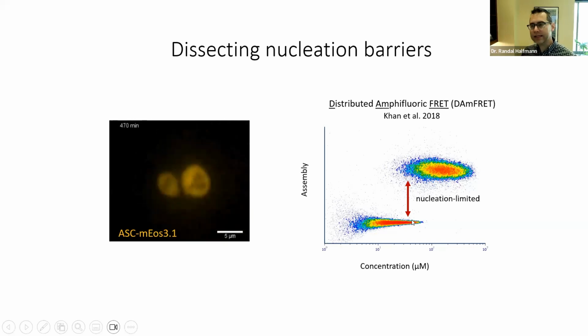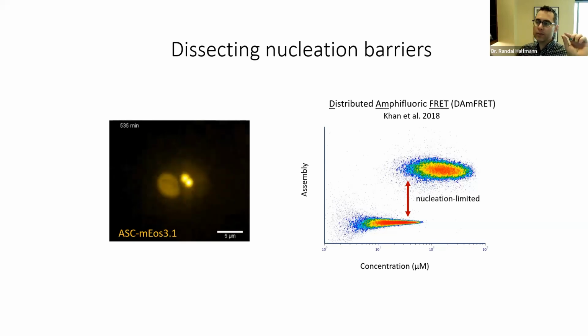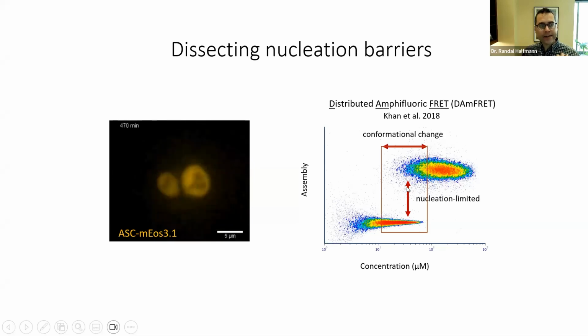So there's some really difficult, kinetically difficult event that has to happen for nucleation for the first little bit of that crystalline polymer to form. But once it happens, the other proteins join on extremely rapidly. And so you don't see any cells hanging out in the middle between these two populations. Once nucleation happens, they jump from the bottom population to the top population almost instantaneously.